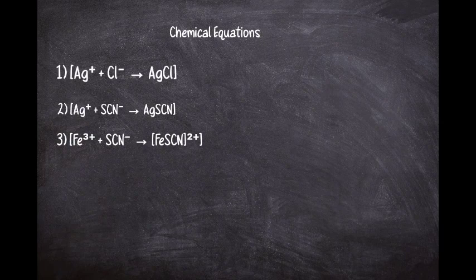As we move forward, these reactions will play a central role in understanding how Volhard's method allows us to precisely quantify chloride ions in a solution. Before that, let's cover the titration process.